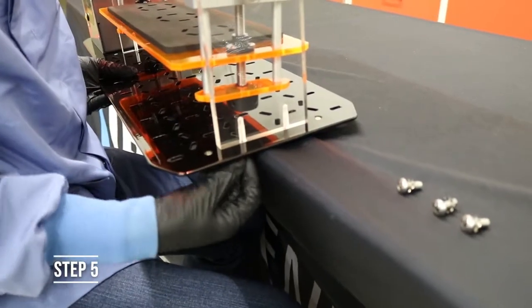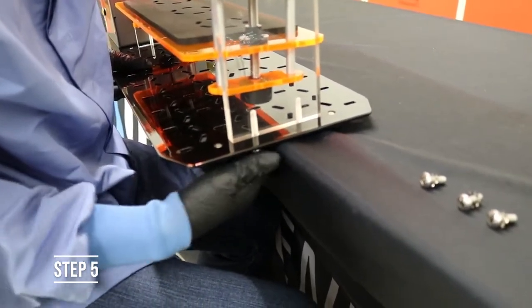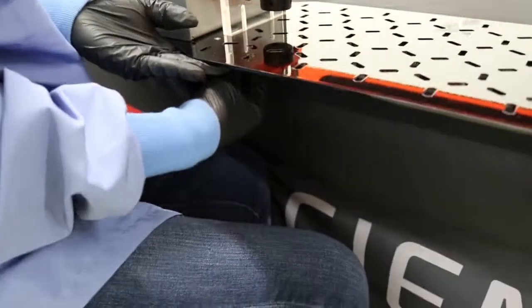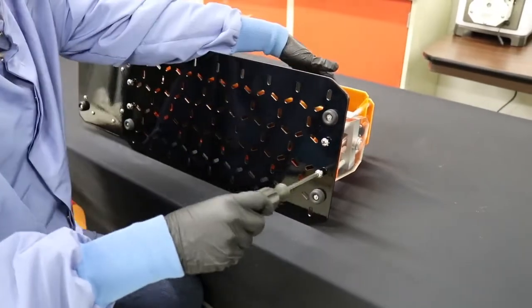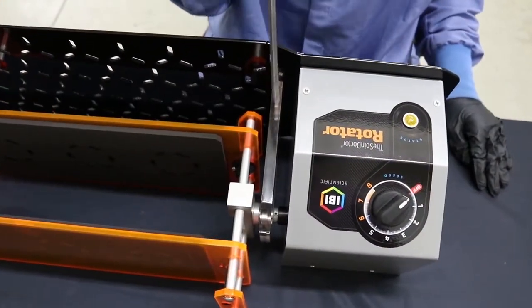Step 5. Align the holes in the base to the threaded holes in the legs. From the bottom sides of the base, thread the screws and the washers into the threaded holes in the legs. You may need to slide the base off the edge of the counter to expose the holes or elevate the base to allow access to the bottom side of the base.